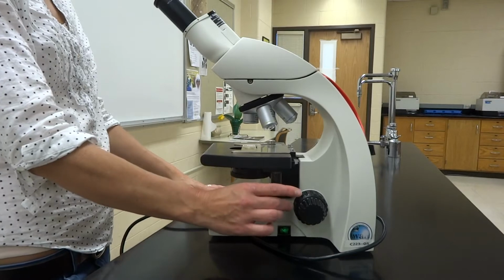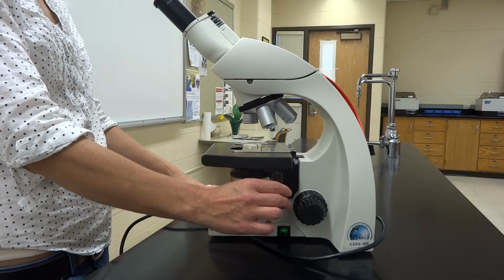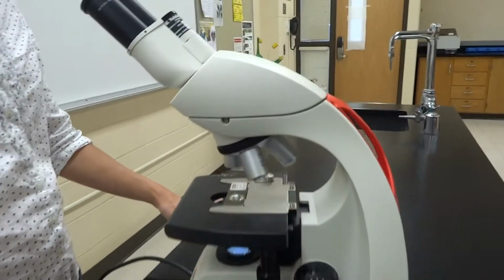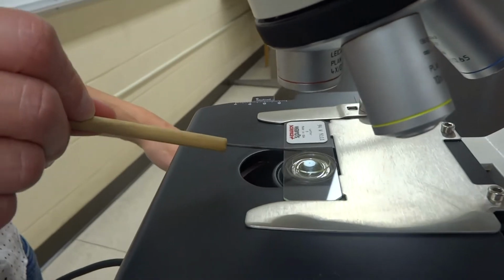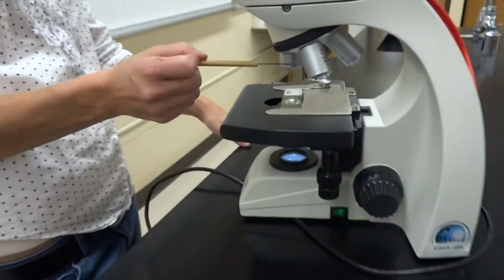And then the next thing you'll want to do is make sure the specimen is in the center of that iris or the condenser lens if you can see it. Okay, so again, I'm going to zoom in. The E on this is centered right in the middle of the lens, so hopefully that will line up perfectly when you actually look through your oculars.